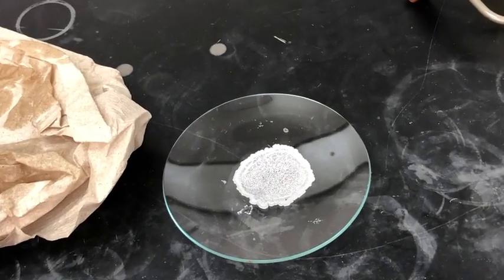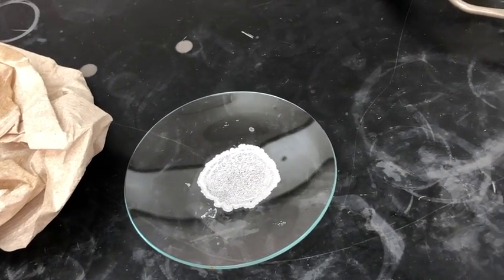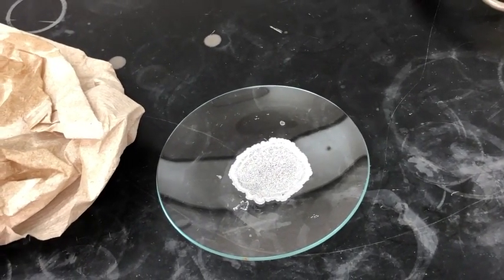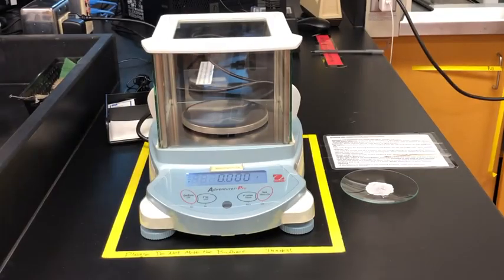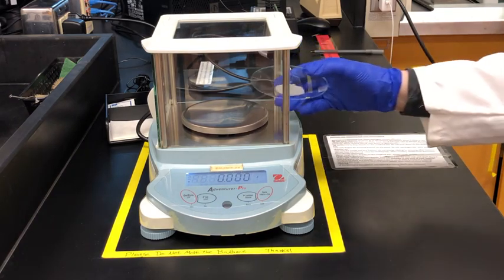Here is our final product and we hope that this is pure aspirin, but we're going to test this by getting a melting point. Before we do that though, we're going to weigh our final sample so we can track how much aspirin was actually in our original impure sample.